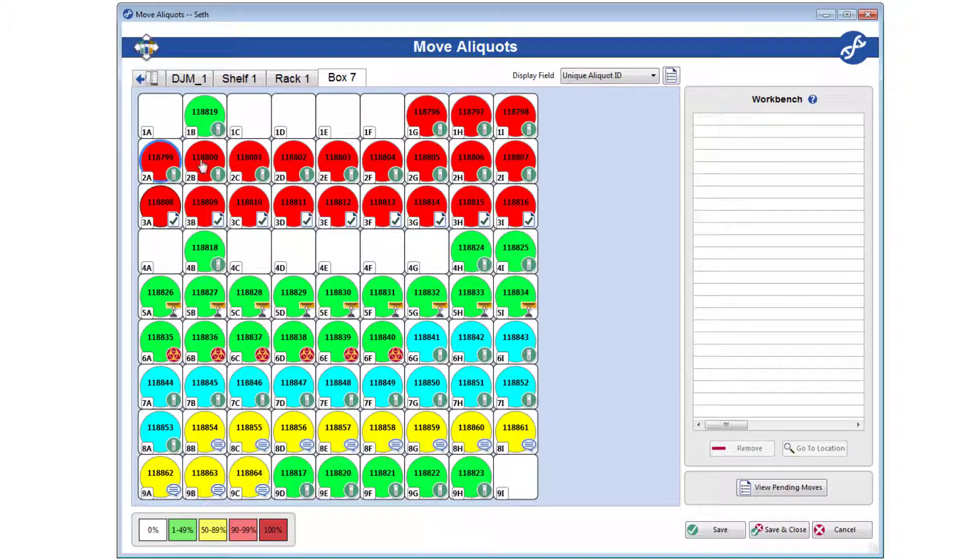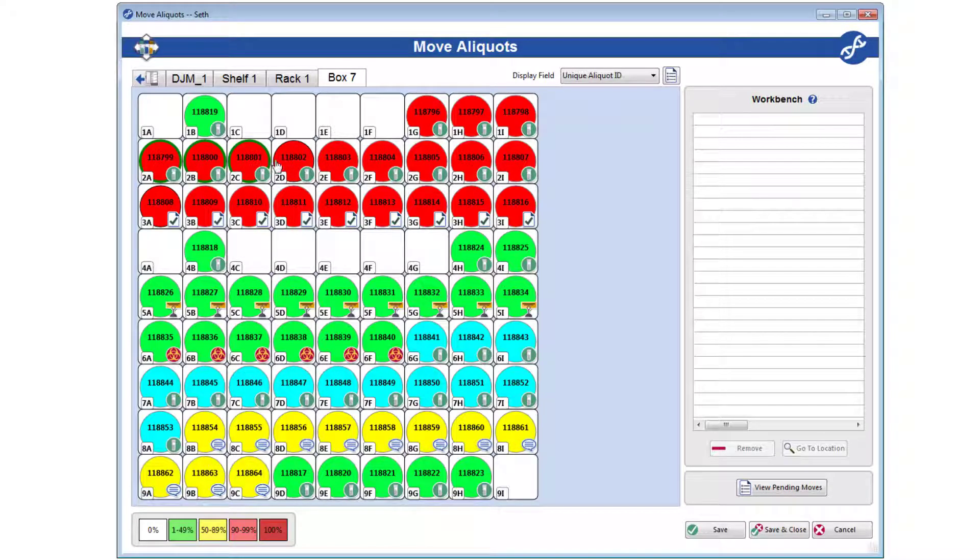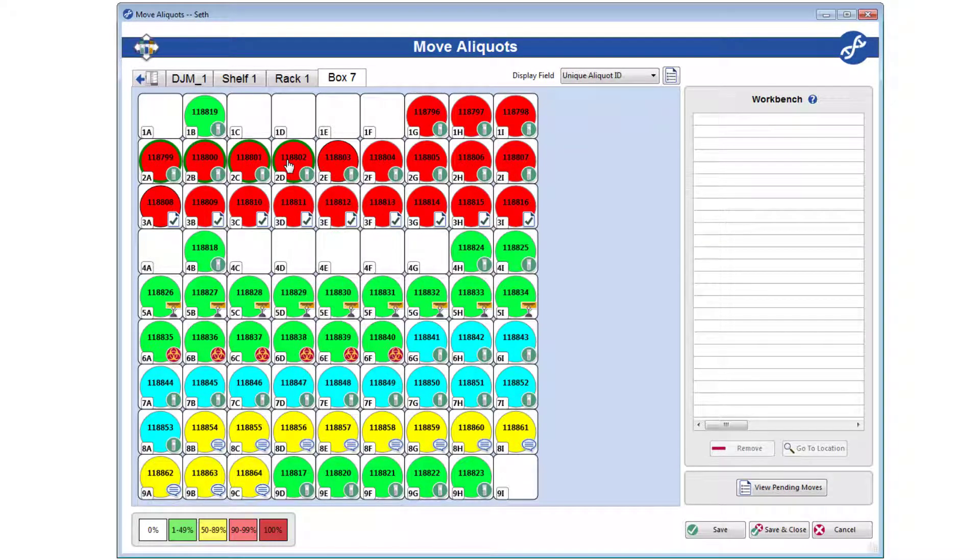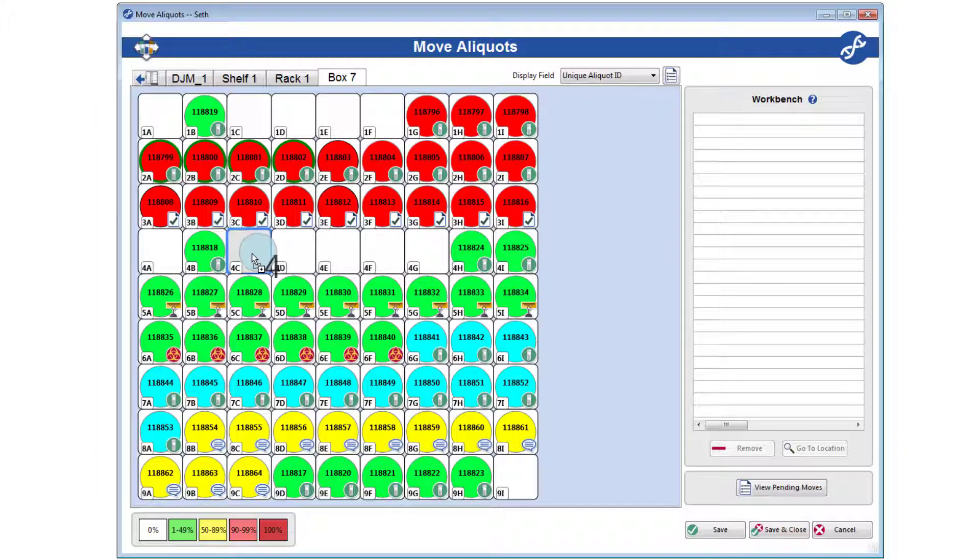To select multiple aliquots at once, use Ctrl or Shift click. Once you have your selection, start dragging.